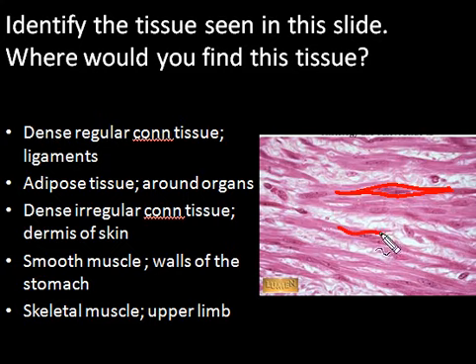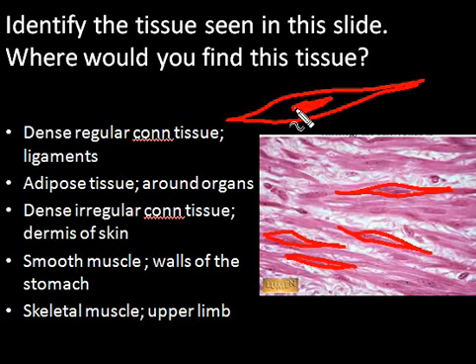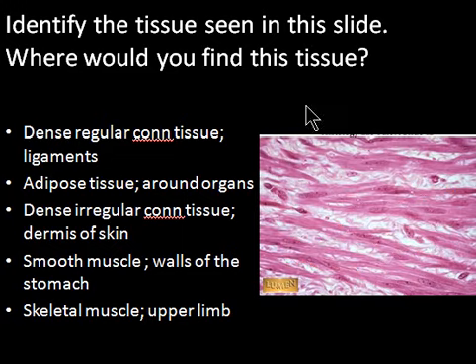Again, look at this one here and here. So all of them, so this is very typical of muscle, where a smooth muscle, where you have the spindle shaped cell and the nucleus lies in the center. If this was connective tissue, like if we know this is not cartilage, it's not blood, so the only kind of connective tissue you could confuse this with is either dense regular or dense irregular. You would think more irregular because of all these spaces in between.